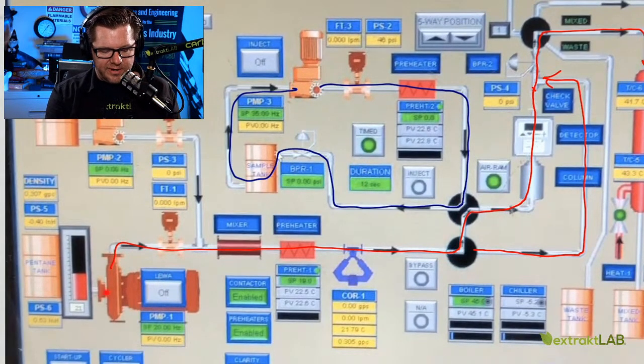very similar here. You have a system where you have the main eluent fluid coming through here, going into a valve, and then through the column, through the detector, and then out into waste or out into one of the reservoirs. In this case, there's an injector pump here too. You can see, that's where the injector loop is coming like this. And it's always flowing around in a loop at a certain pressure. And when we want to inject part of the sample onto the column, this switches so that this pump is now flowing through the column and delivers the sample in a small amount to the column, does the separation, and then it switches back and this pump continues to push through.